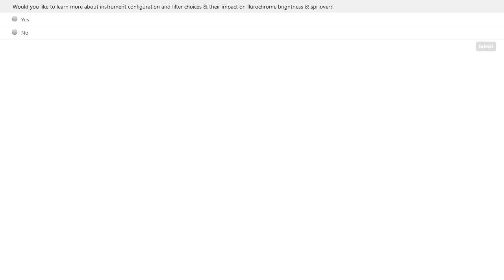Thanks, Manisha. I just wanted to piggyback on what Bob said. In the end, the key concept we're talking about is resolution. So selecting the appropriate color, having a few options of bright markers in the same channel, might not resolve, or the dim markers might not be able to resolve the specificity of your interest. So the key concept of having dim antigens on the brighter formats still remains the same across platforms.